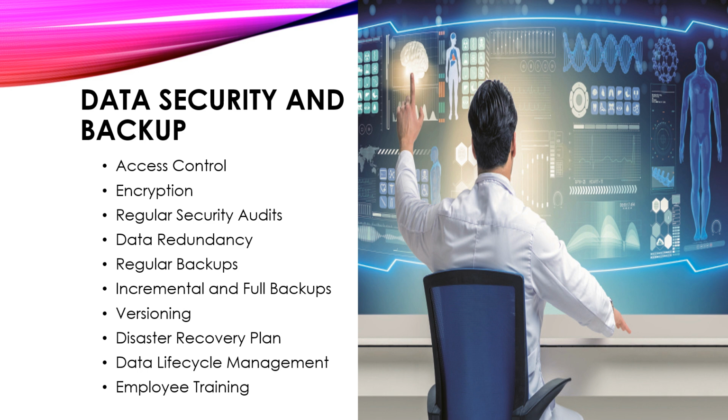Next is data redundancy. Maintain redundant copies of data to prevent data loss in case of hardware failures, cyber attacks, or other disasters. Redundancy can be achieved through mirroring, replication, or distributed storage solutions.